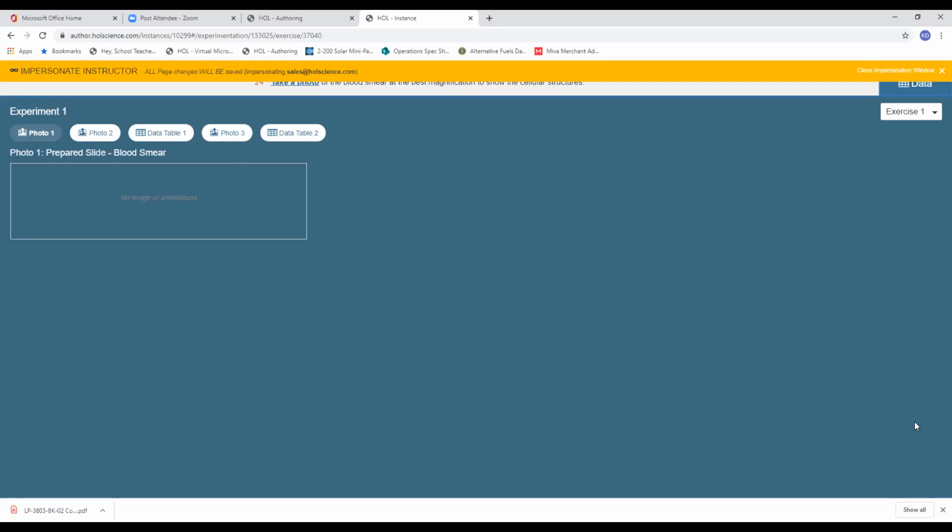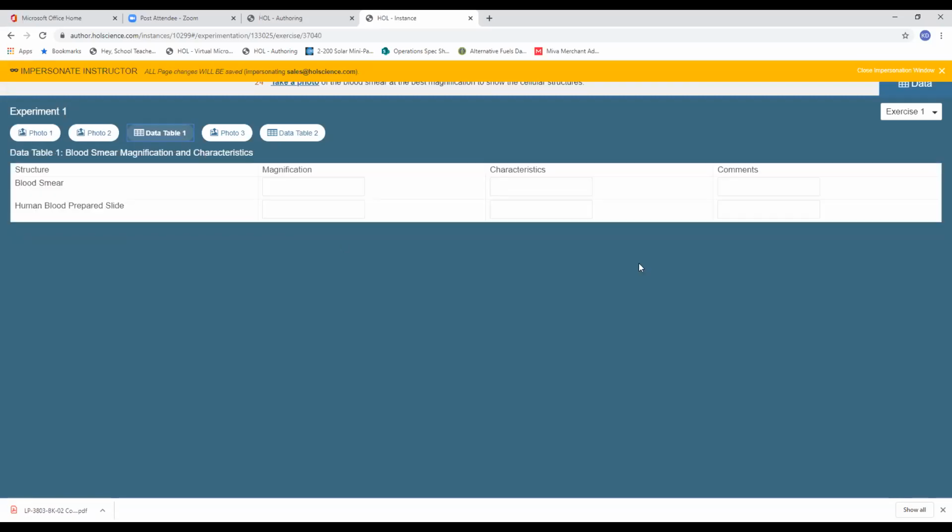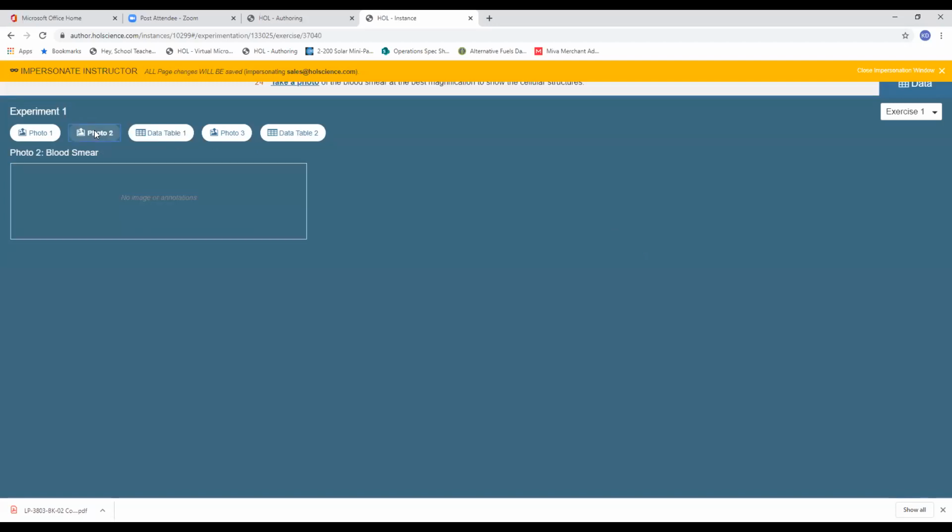Throughout our procedures, students are expected to not only complete data tables of their experimental results, but also upload photographs of their completed work. I get a lot of questions over the years from institutions and instructors looking to take their classes online, and they always have a very real concern: how do they assure that students are actually conducting the experiments? Best practice is to always require students to upload visual proof of their procedures and of their results, and whenever possible in our curriculum, we require that of students. We'll see examples of students' uploaded work in just a moment when we go into the instructor and grading view for a particular exercise.